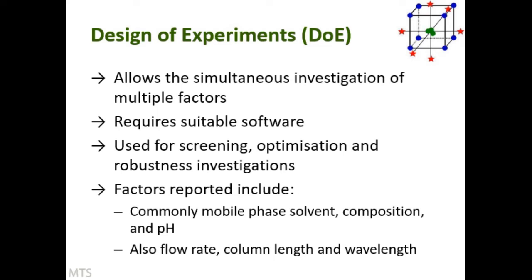Now, I did a literature review before I put this presentation together because I've updated some previous work that I've done. And if you do a Google search on using DOE for HPLC method development, there is a vast number of publications and resources out there.